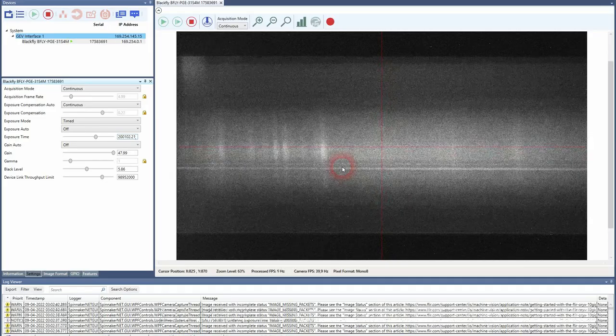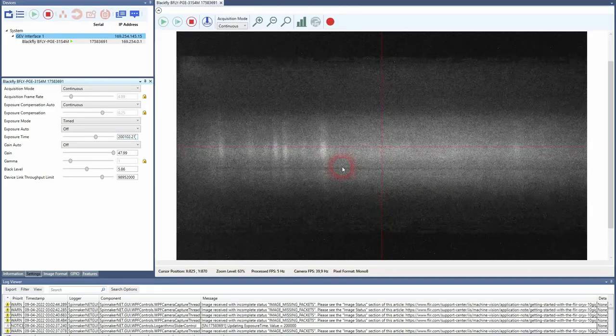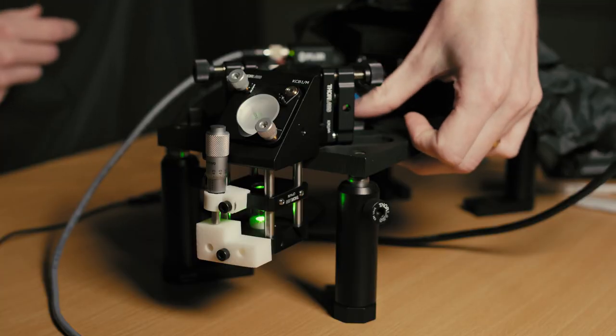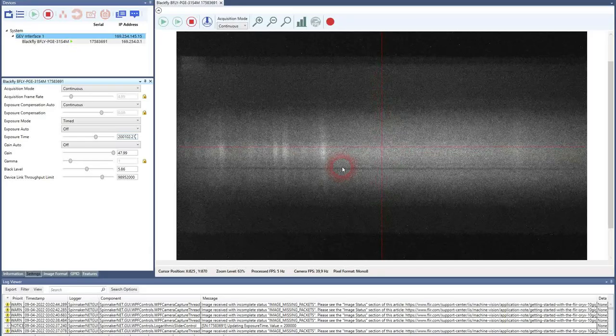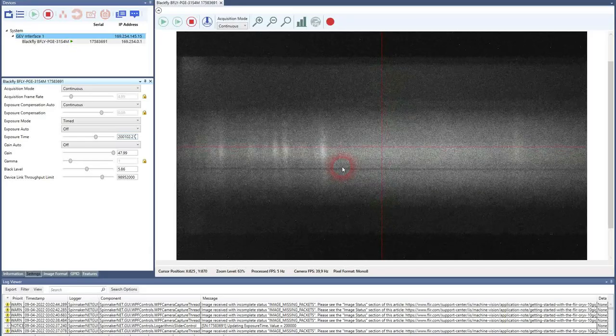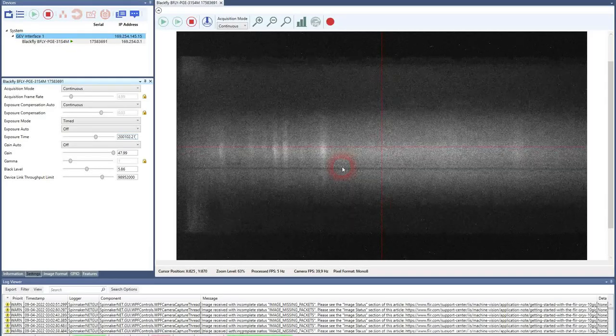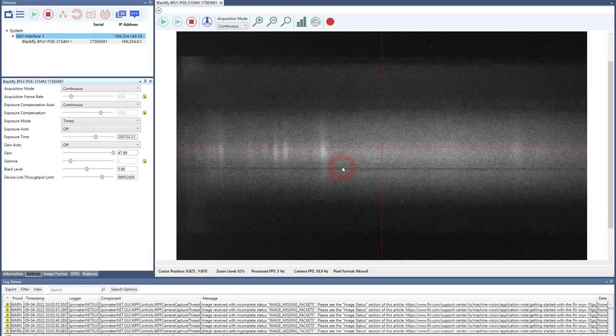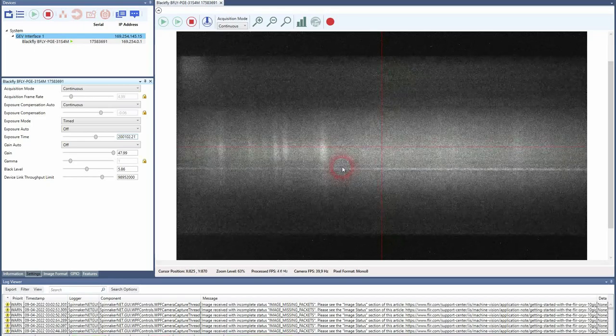So what we have to do now is to try to optimize. It doesn't change anything. So it's pretty good now.